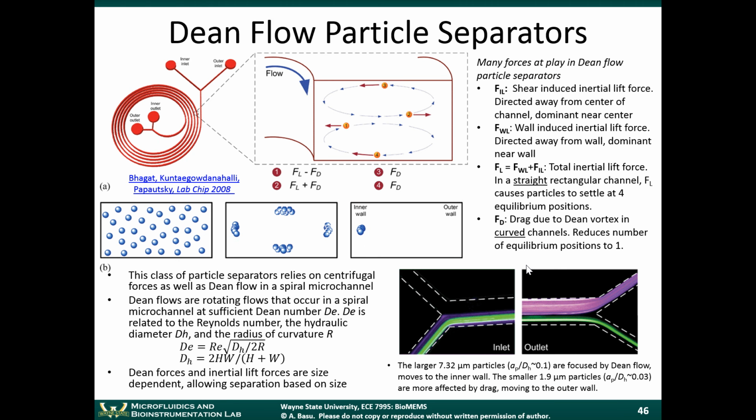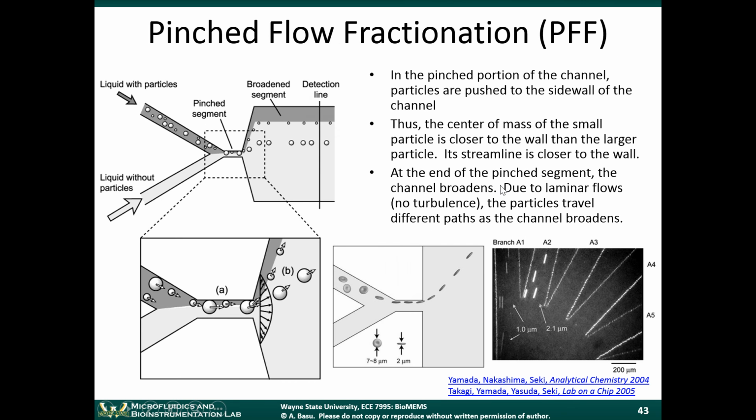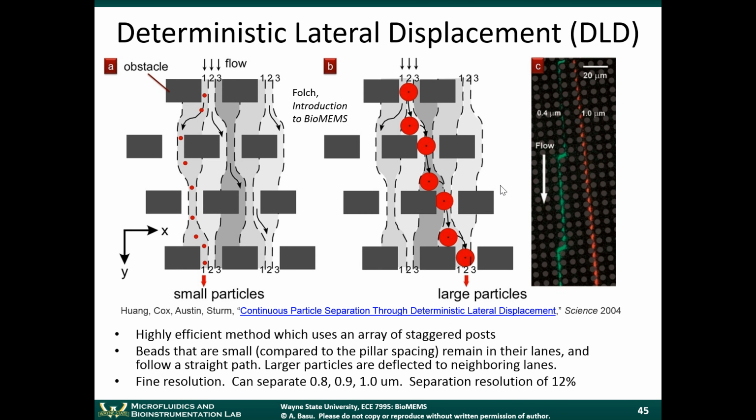So going back to inertial techniques. These three methods of particle sorting all relied on just laminar flow, the interaction of particles with laminar flow, and in some cases the channel walls, in some cases the obstacles in the channel.